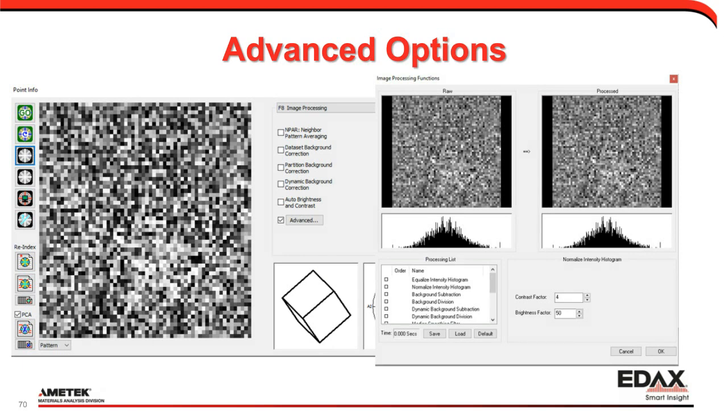So I'll reiterate what I said: just sit down and play with the advanced options to see what they do, what they don't do. Again, remember, order does matter. If I do a division before subtraction, I get different results than if I do a subtraction before division.